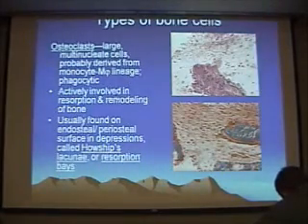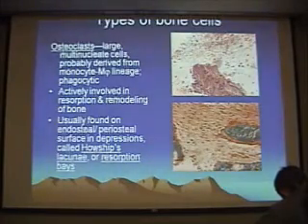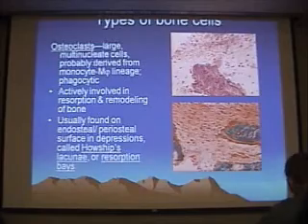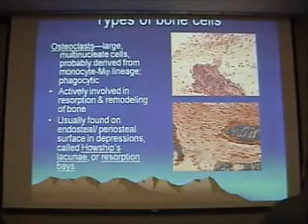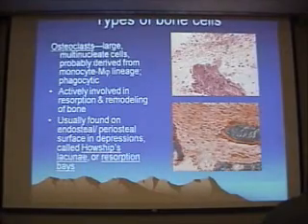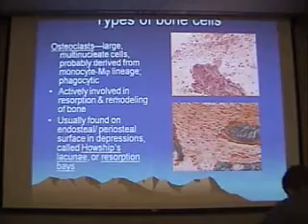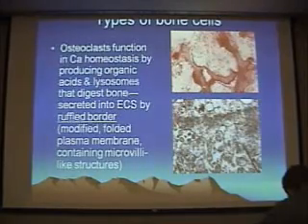And note, here we have osteoclasts and osteoblasts side by side. So this little spicular bone is having bone formed on this side of the process and removed on this side. So essentially it's being remodeled to change its overall shape. And that's the whole point of bone remodeling in general.